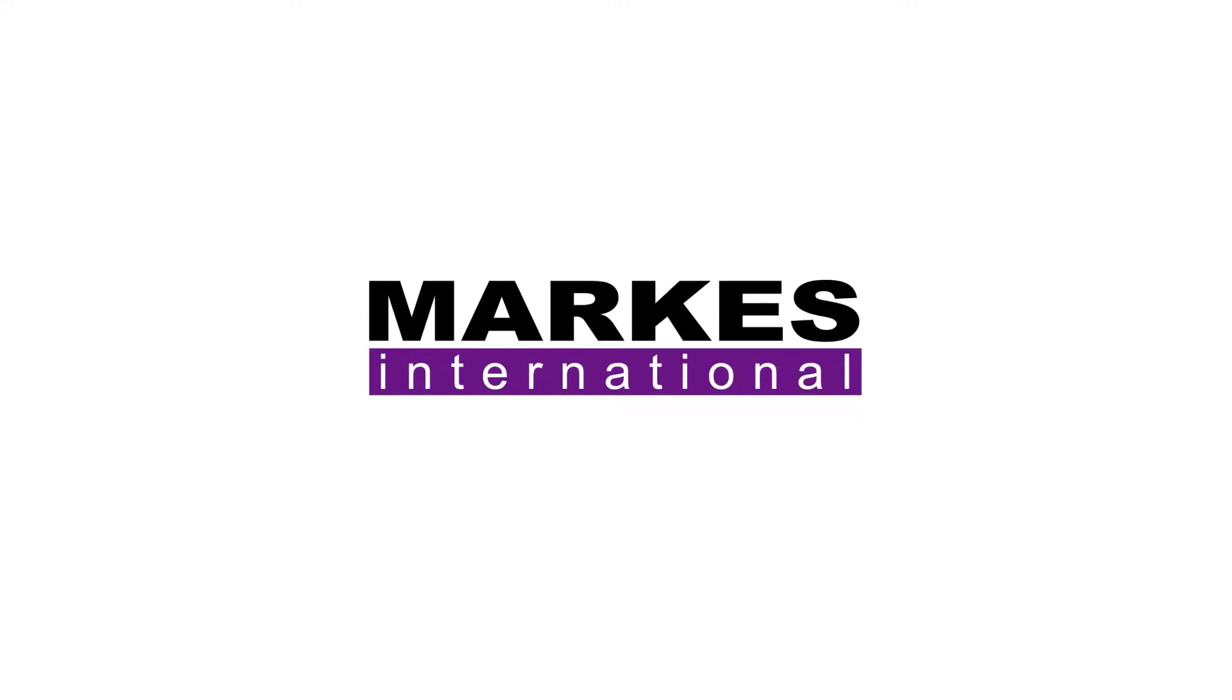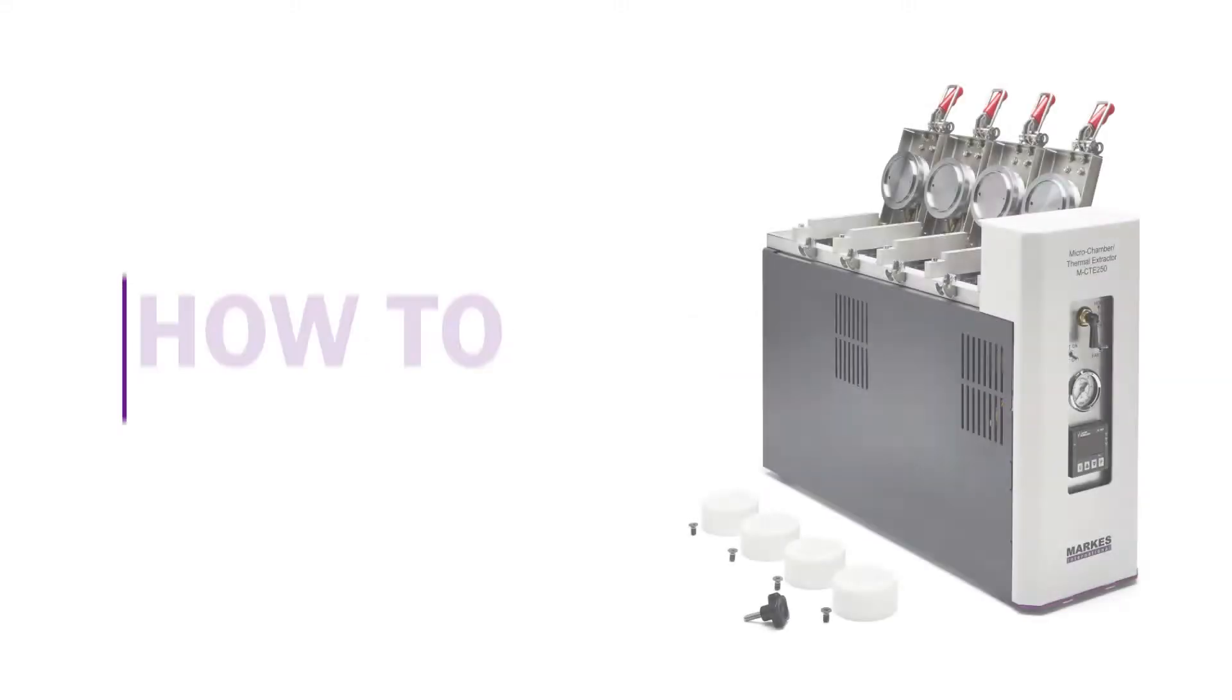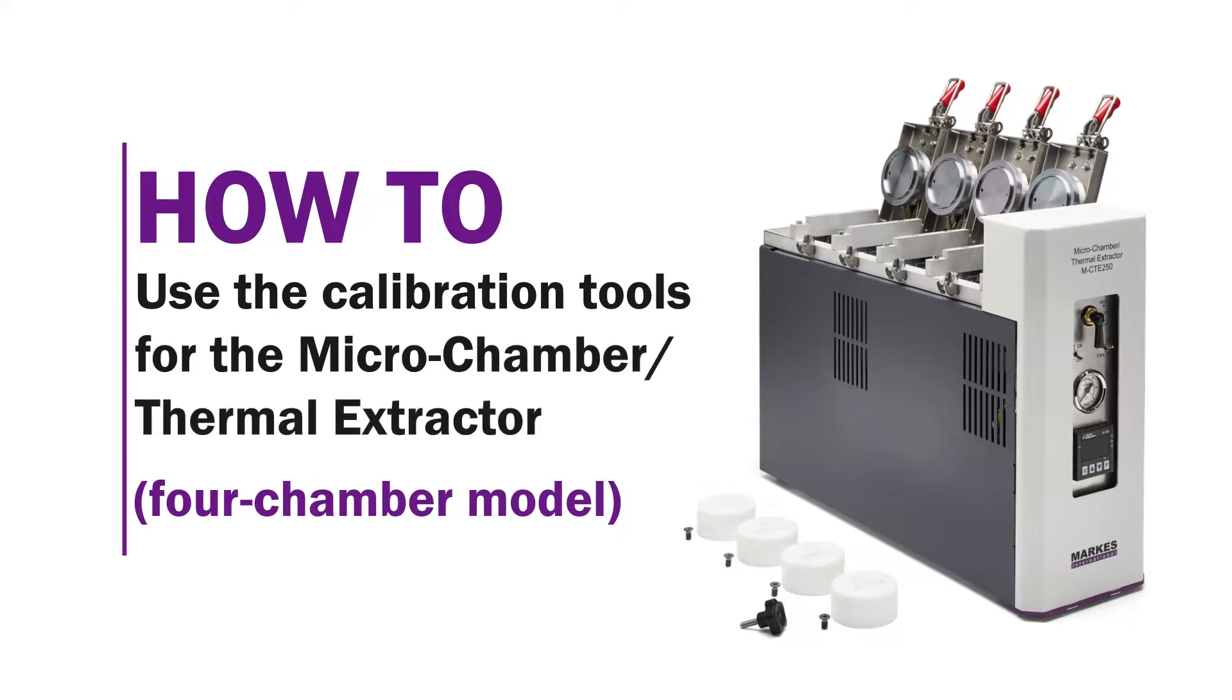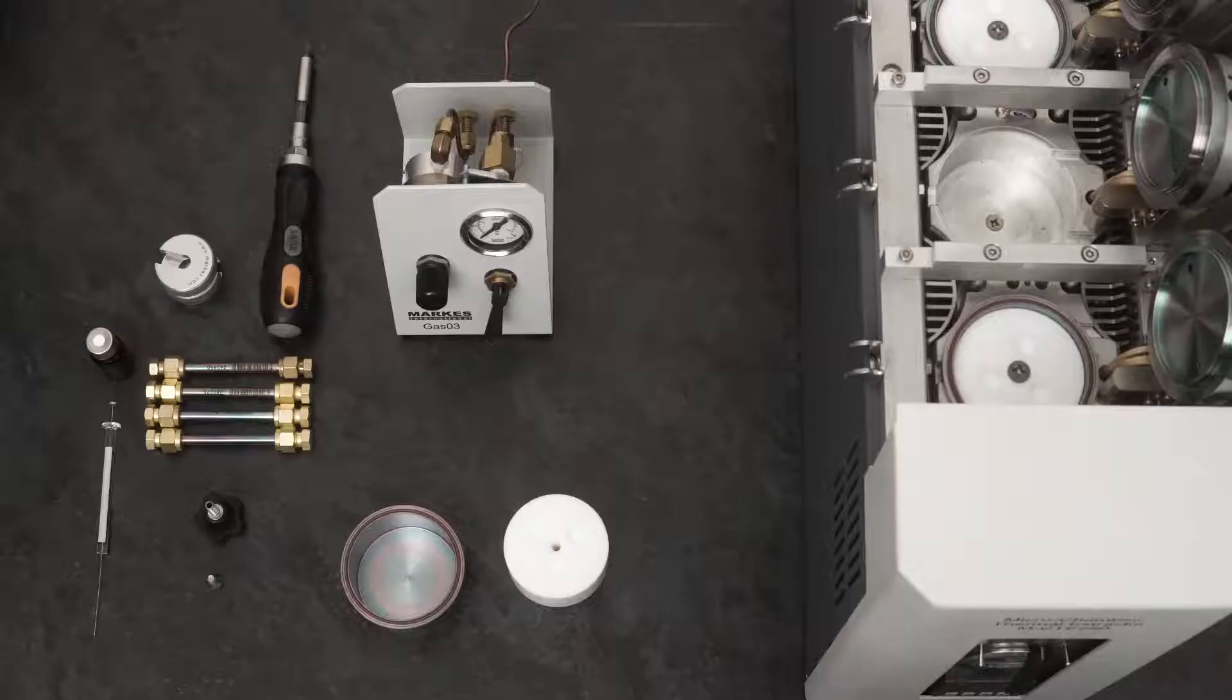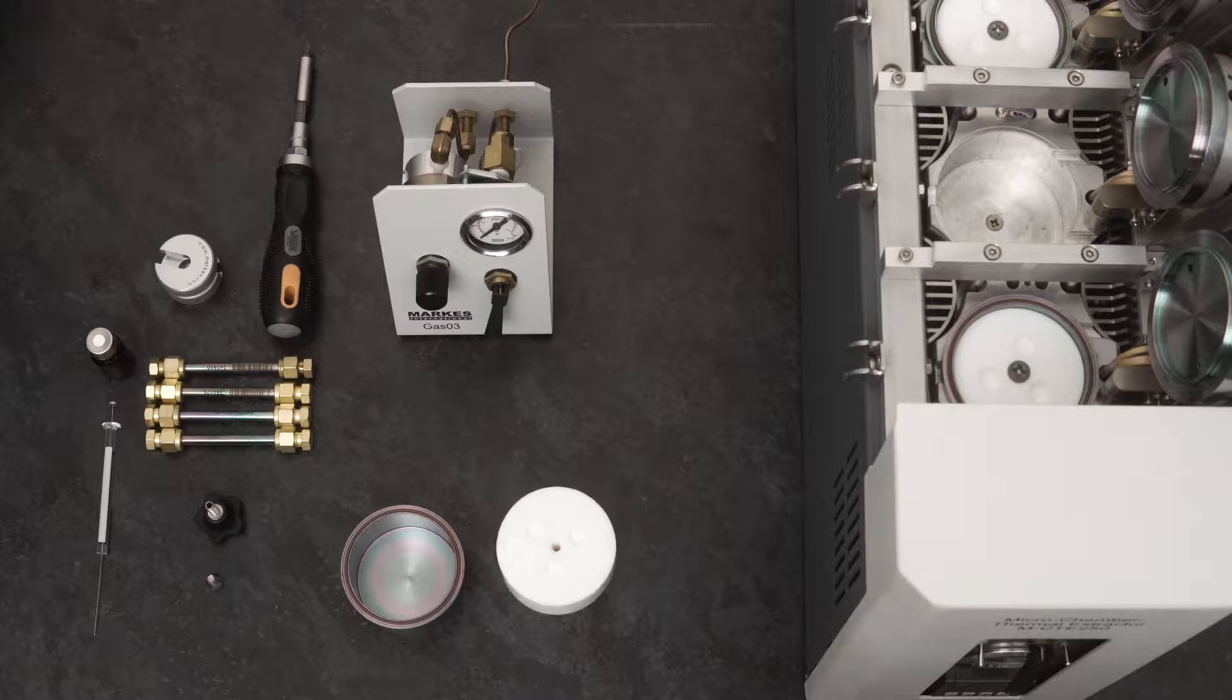The following video will show you how to use the microchamber thermal extractor calibration tools. The calibration tools come as part of a kit containing four PTFE sample blocks with three wells, four inert coated blanking screws, and one tool lifting handle.